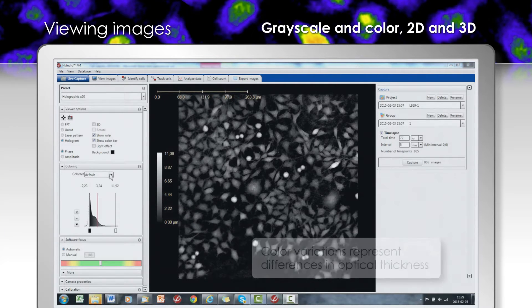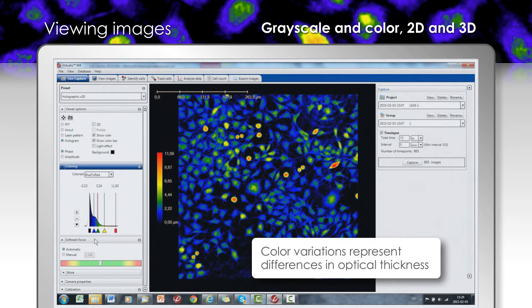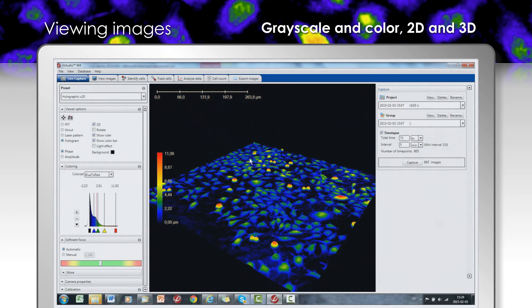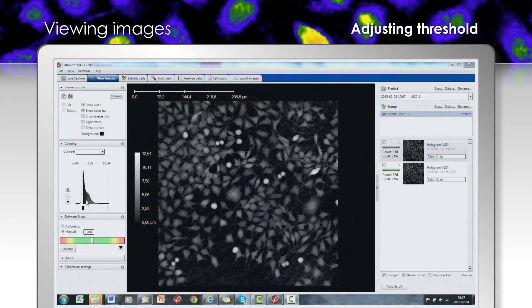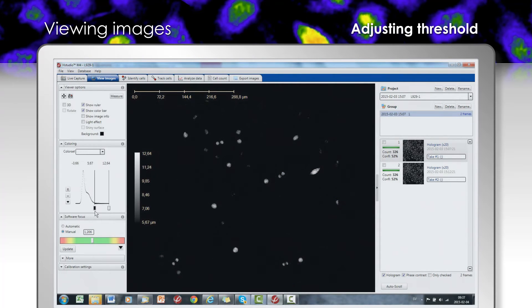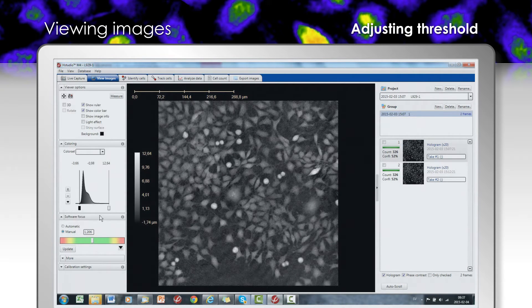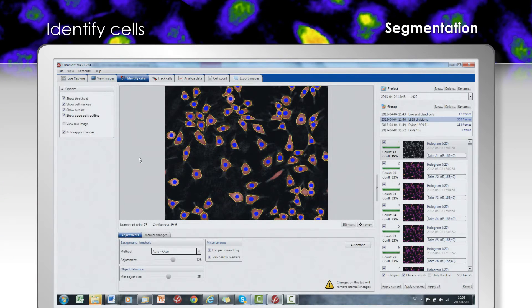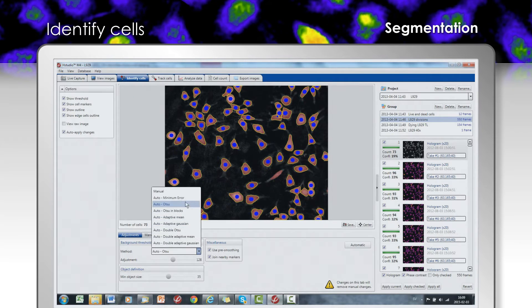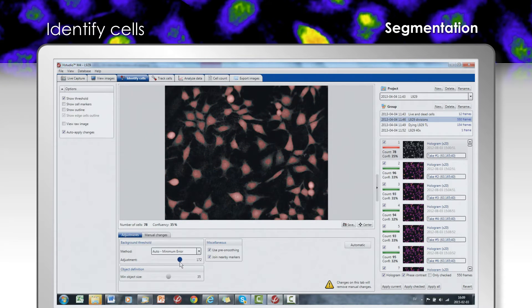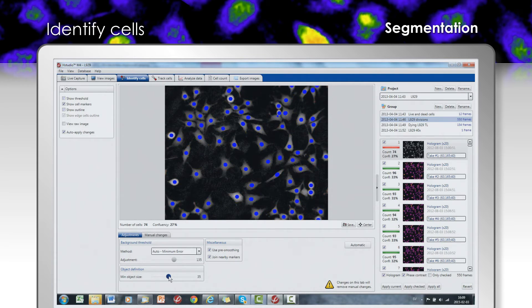Images can be displayed in grayscale and color, 2D and 3D. Adjusting threshold allows digital filtering of cells of interest — mitotic cells in this example. Individual thumbnail images of the data set can be selected for viewing. Once time-lapse videos have been recorded, various analysis choices can be considered. The process starts with selecting one of many available segmentation strategies. The suggested segmentation is fine-tuned by adjusting background threshold and optimizing cell size.